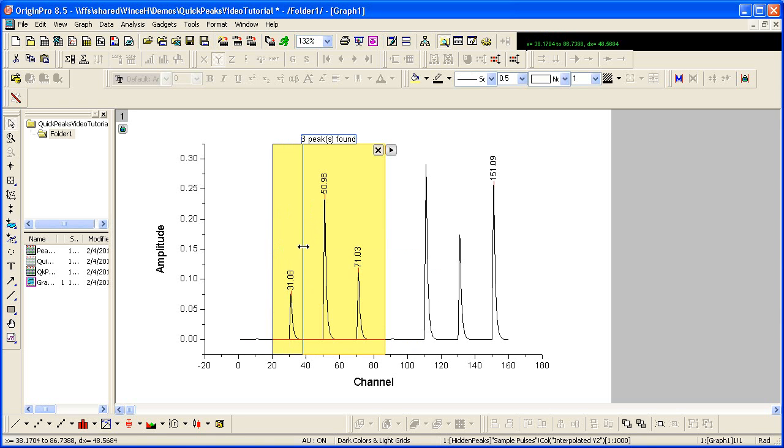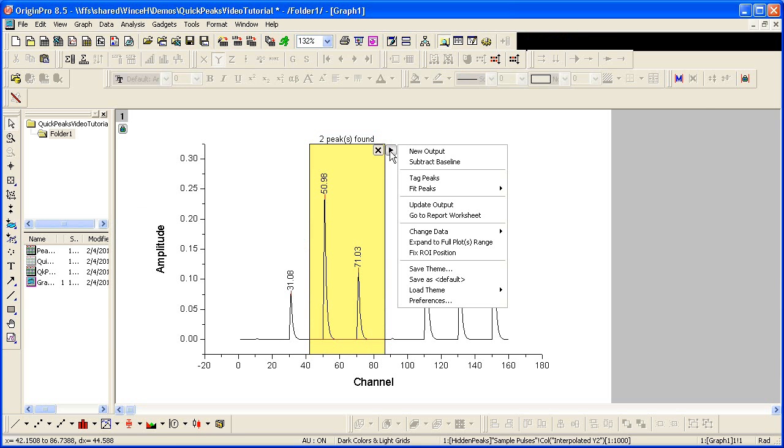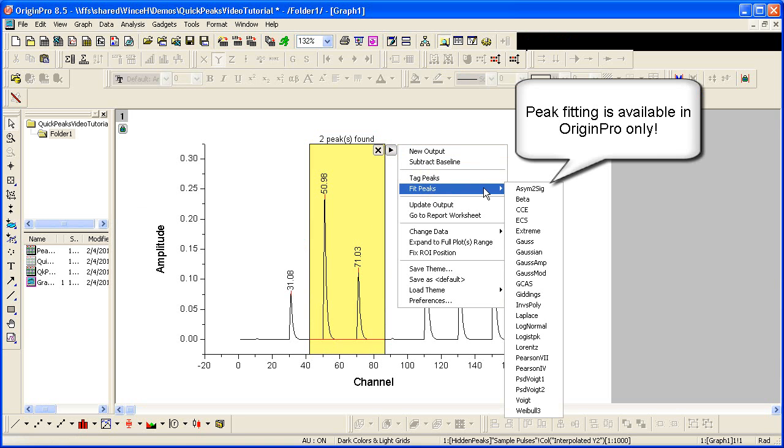I will select two of my three output peaks and from the flyout select Fit Peaks and I will fit these with a Lorentz function.